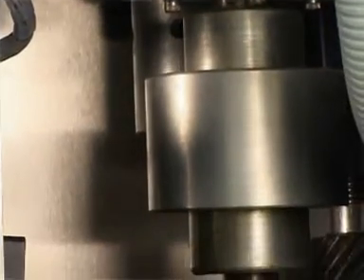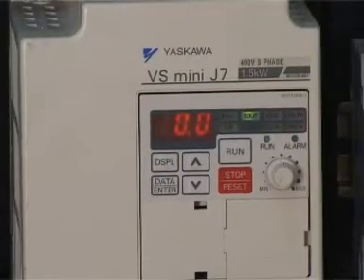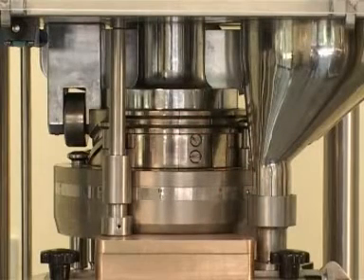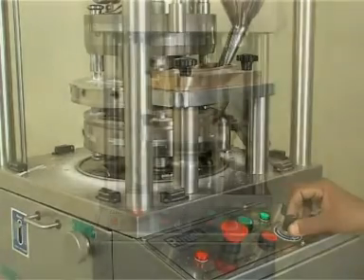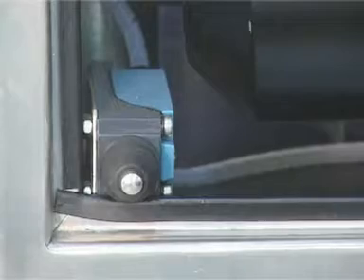The machine is centrally driven through a gearbox with a fixed pulley. The speed is controlled by an AC variable drive. The machine is equipped with features like inbuilt pre-compression, force feeder, and outside controls for tablet weight and thickness. Safety features include limit switches at the top and lower guard.